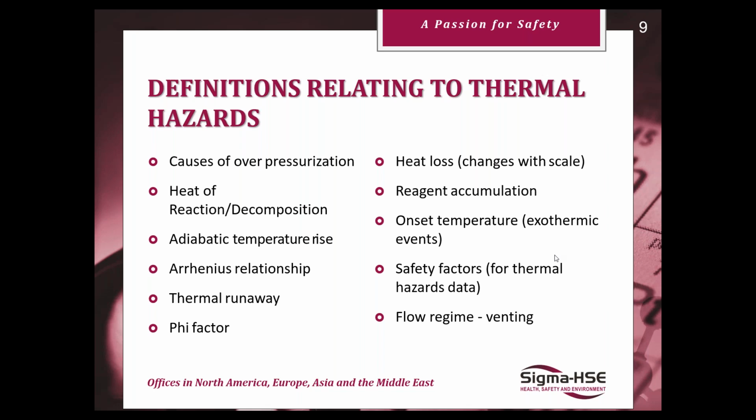So we've got some key definitions here relating to thermal stability hazards. Causes of overpressurization, this is one of the key hazards from secondary decompositions. Heat of reaction or heat of decomposition is a measure of how much energy is given out by a reaction or decomposition.